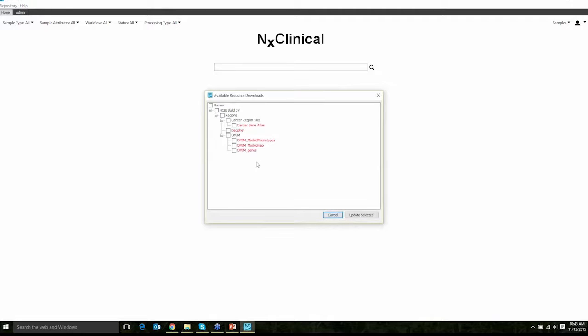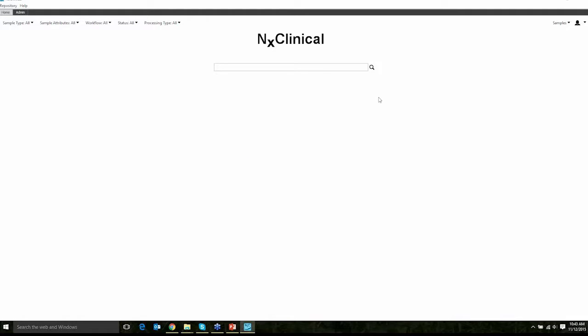you don't want to have different people have different tracks at the same time. So if as admin I decide, okay, I want to update all the OMIM tracks, I click that and I update it, and then next time anybody logs into the system, their OMIM track is updated, so everybody has the same version. So we are curating all of the OMIM and ClinGen and cancer tracks that we monitor for updates and make them available as soon as they get updated, so the admin can set a policy that they want to update these every month, every week, every quarter, and that is done.